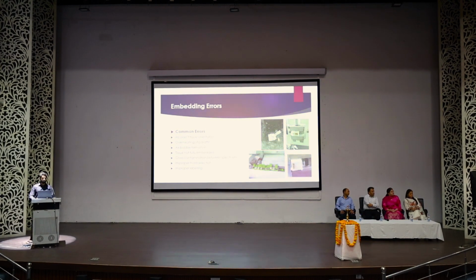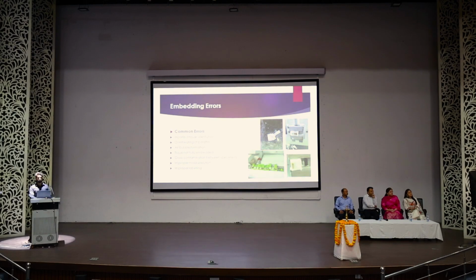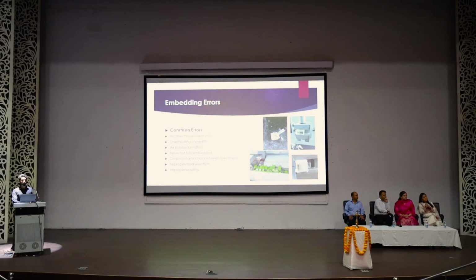The next challenge we face in embedding is cross-contamination between specimens. As you can see in the image, multiple plastic tissue cassettes are open at a time, and these are a few blocks. One block that is folded or set in the block holder. You can see the tissue has been embedded at one side of the block, and it is not an ideal position of a tissue to be embedded.